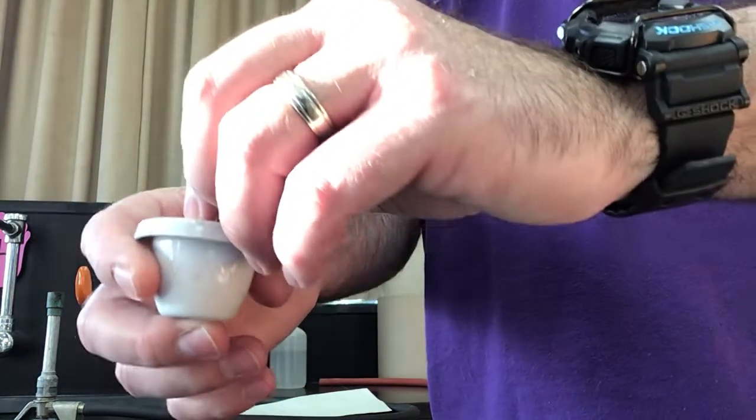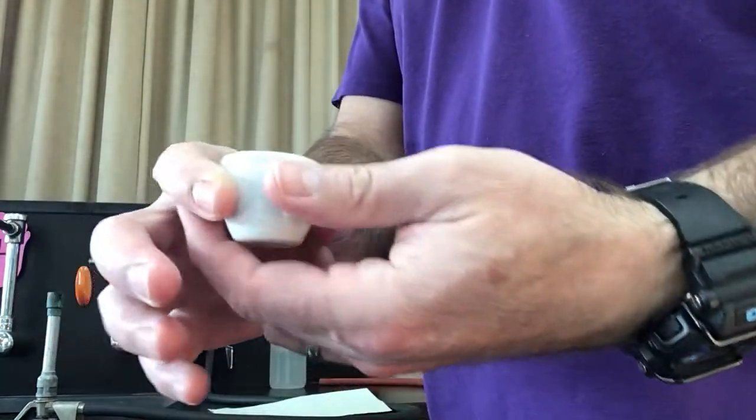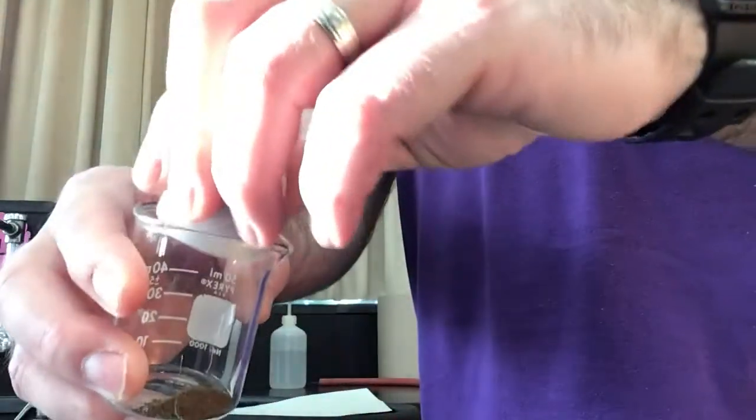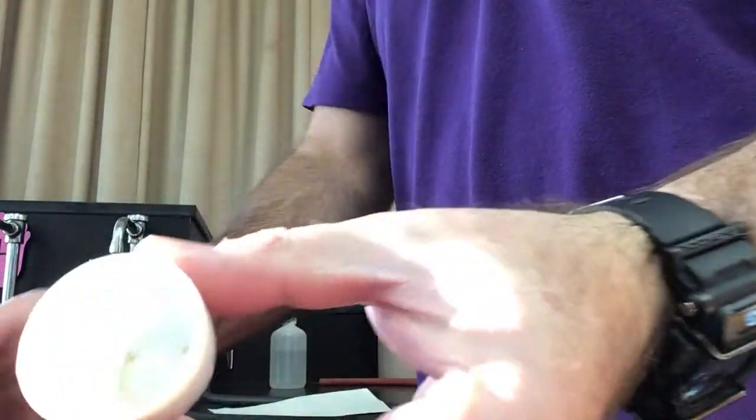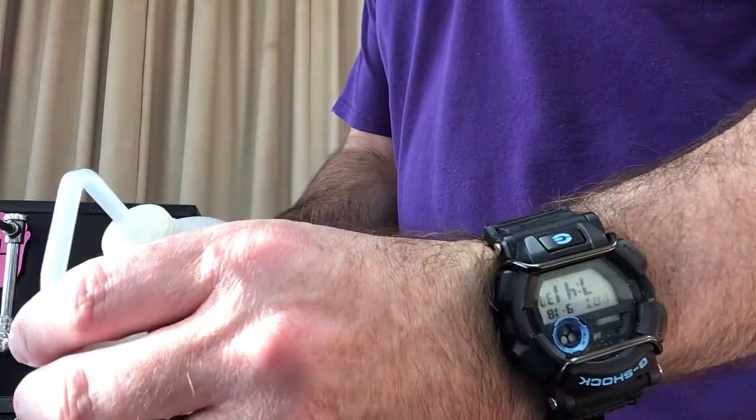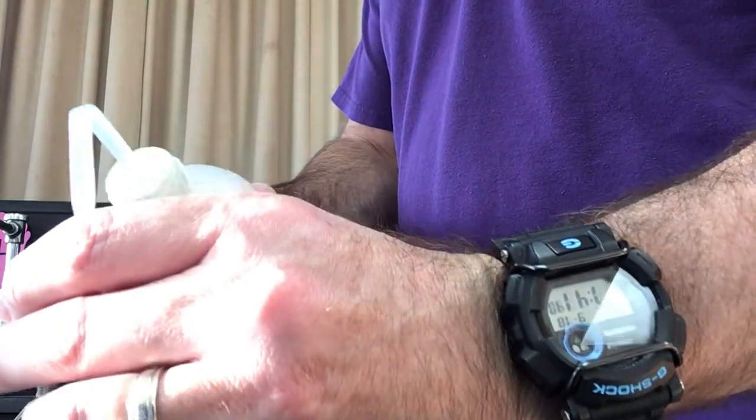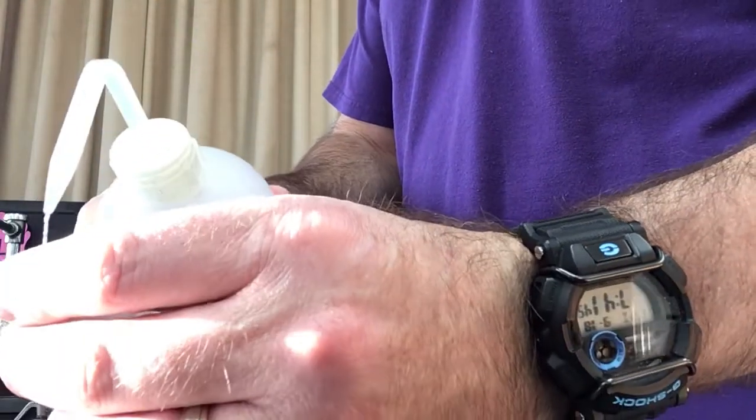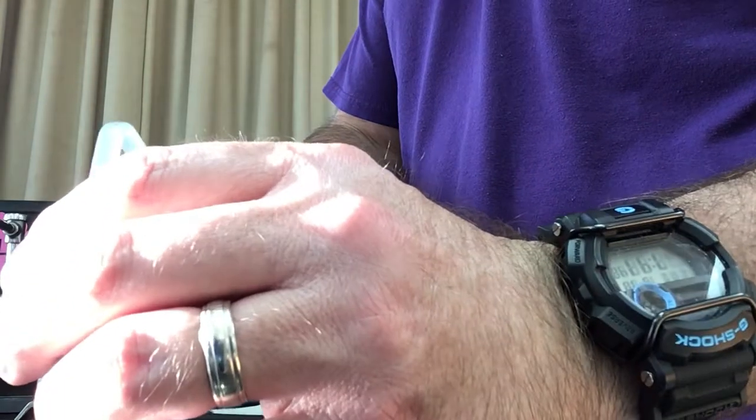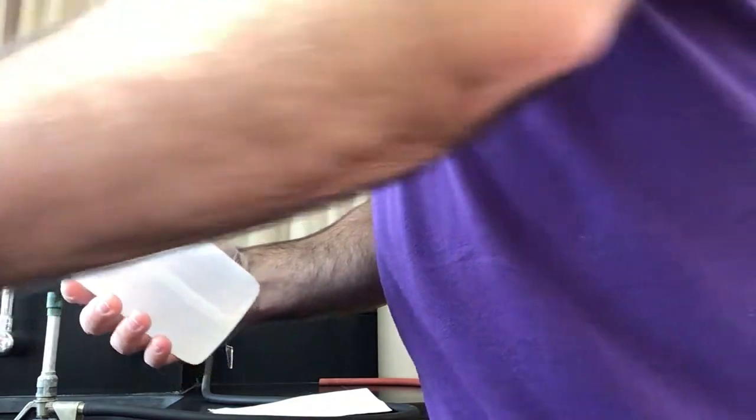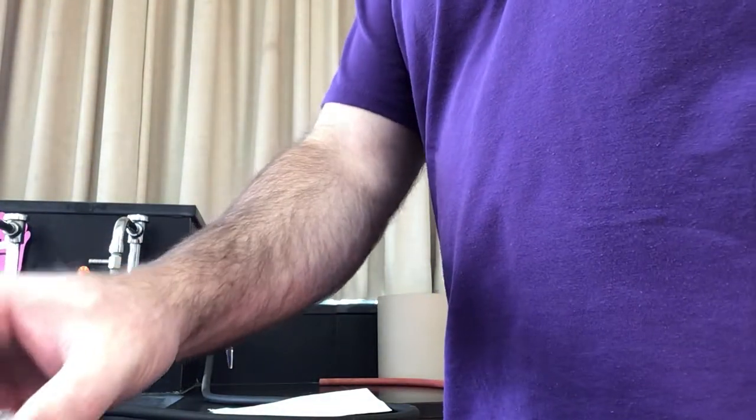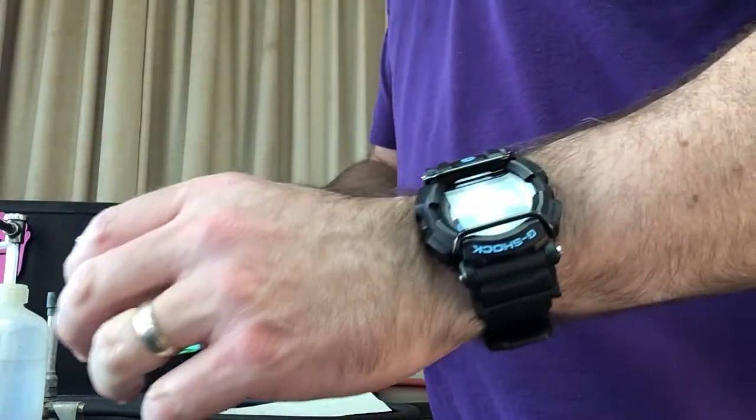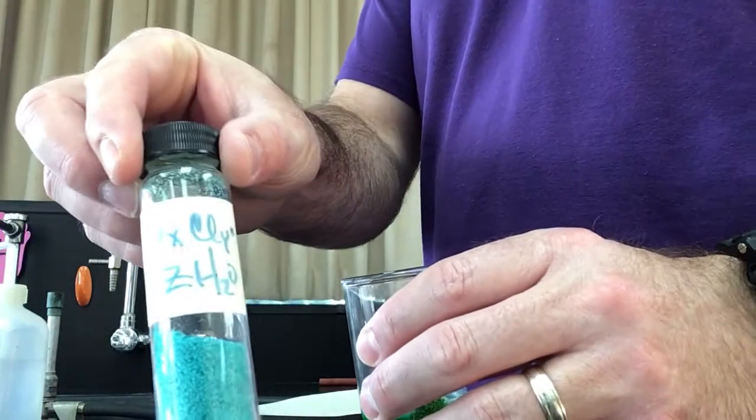Now we're going to dump this into a 50 milliliter beaker. There's still a little bit of stuff in there, so we're going to rinse this a couple times with some water and then dissolve our solid. It might seem kind of weird that we heated this up to get rid of all the water and then now we're going to dissolve it, but what we had to do is figure out how many moles of water were attached in our original sample.